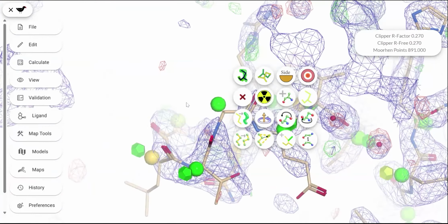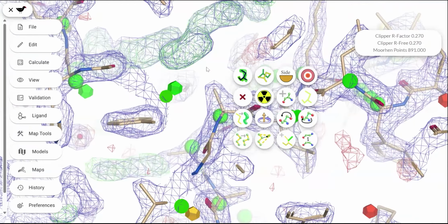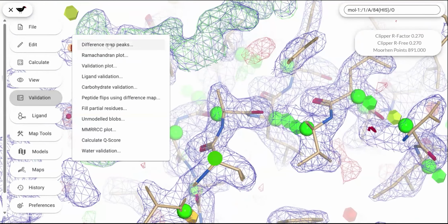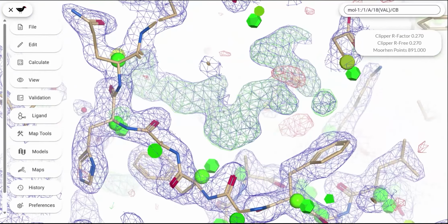This is one part of the process. Manually refining and then feeding it back into auto refine in the other programs that we'll be introducing. So say, for example, if you had enough of validating everything as much as possible, and all of your ligands and everything seem to be fine, what we do want to do is go back to this unmodeled blob. We see this humongous blob over here that's just sitting here. This is that ligand. This is that inhibitor interacting with this protein.